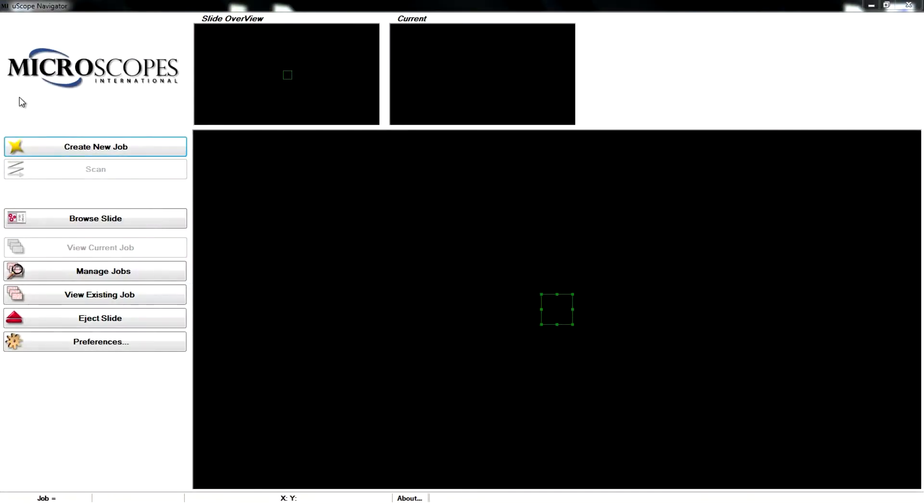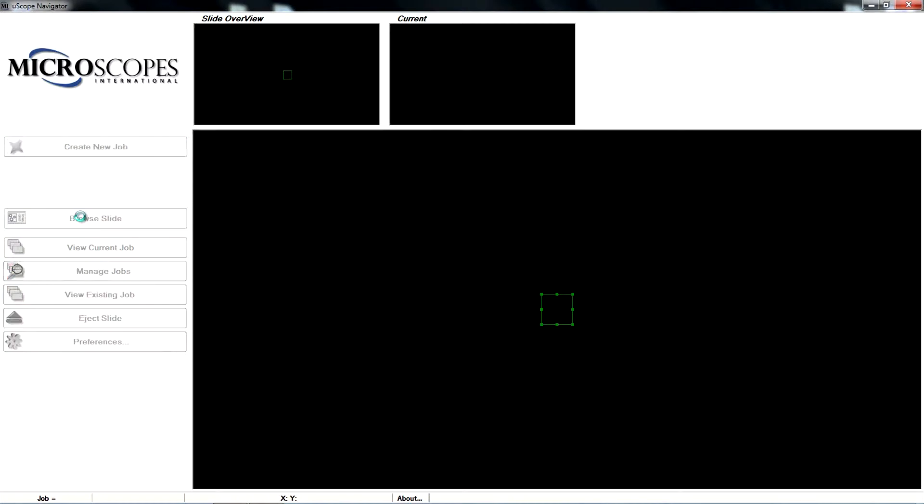The Uscope MX2 Digital Microscope can browse media samples on glass slides. To begin, insert a slide into the microscope and click on the Browse Slide button in the Uscope Navigator software.